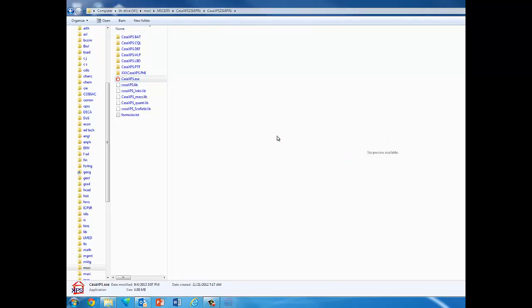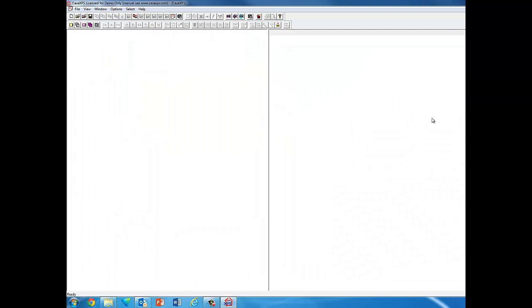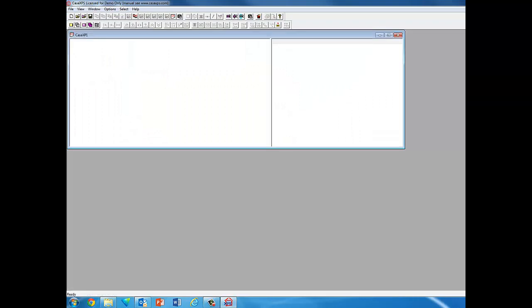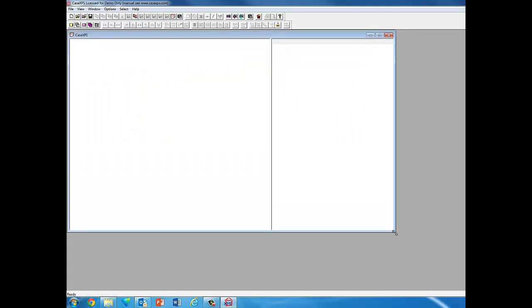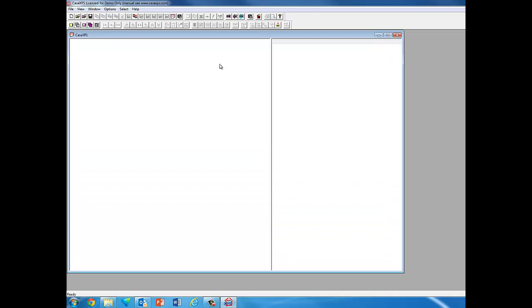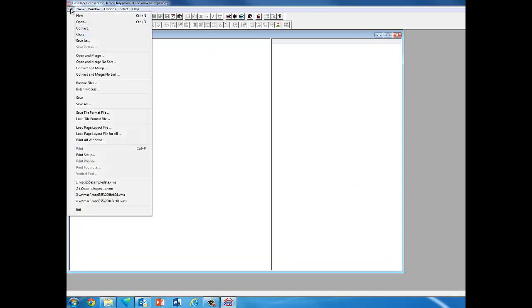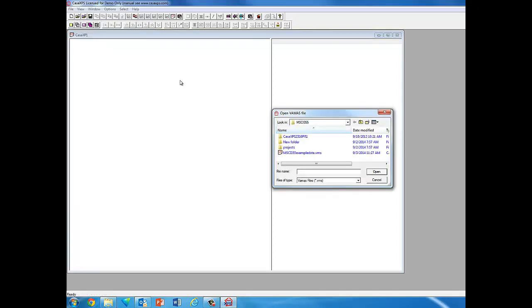The program opens up and now we'll open a file. In this case we'll just use some sample data in that same MSCI 355 folder.